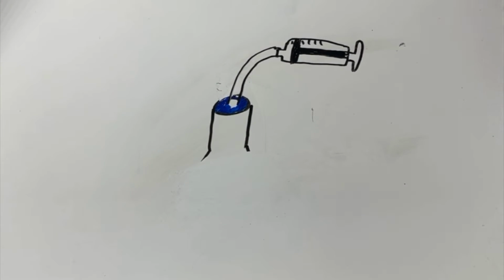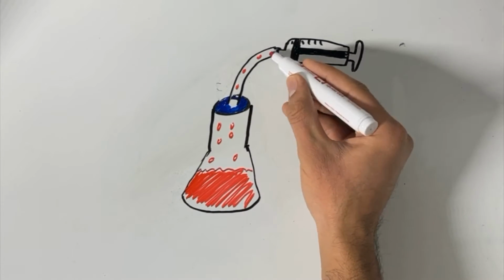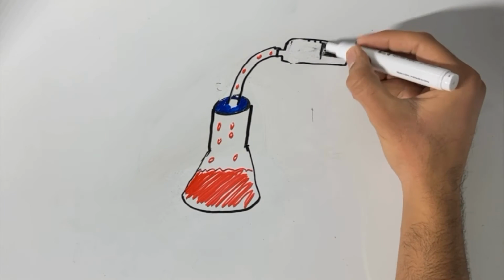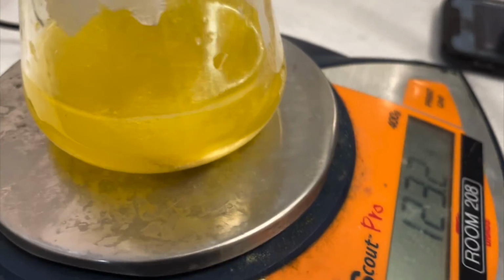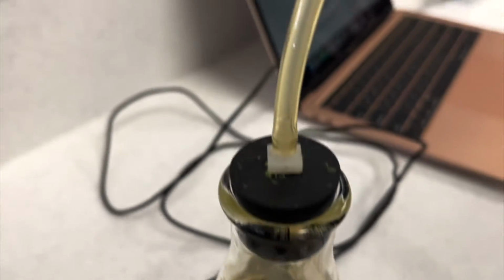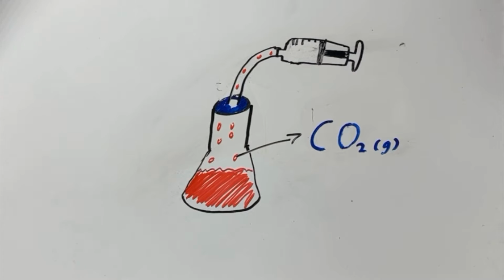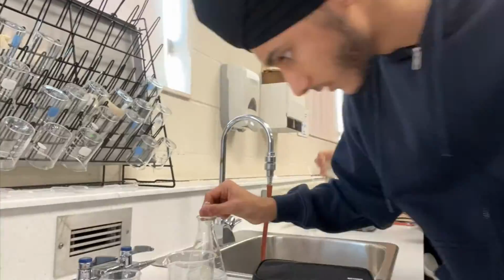By measuring the volume of gas produced by the reaction, one can determine the change in the volume at a set time interval, allowing us to find the rate of change of reaction. When the tablet is dropped in the water, the reactants are allowed to react. One of the products of the reaction is CO2 gas, and we can measure the volume of gas by using a gas volume measuring apparatus, which in our case was a stoppered flask with tubing leading to a syringe. The pressure in the container would build up and consequently push the syringe outward until the pressure reached an equilibrium.